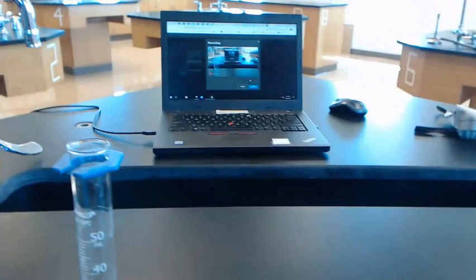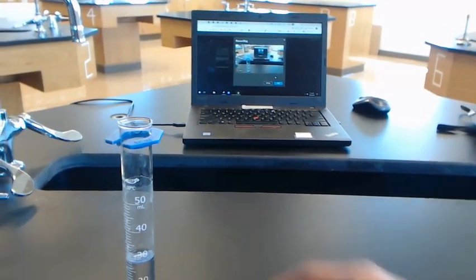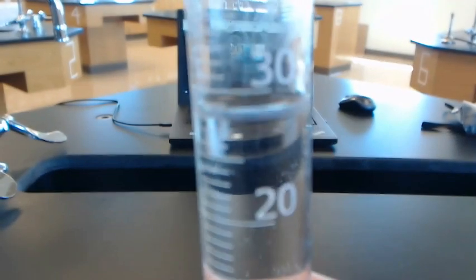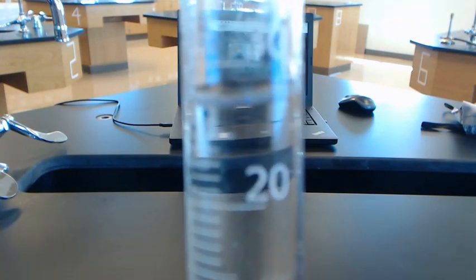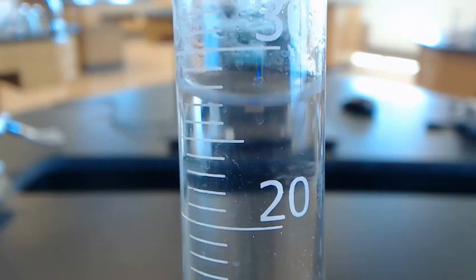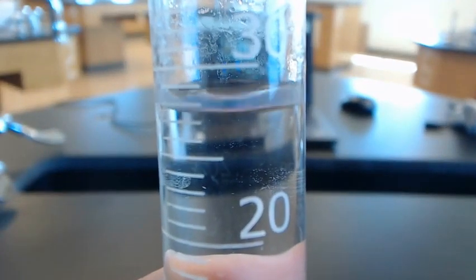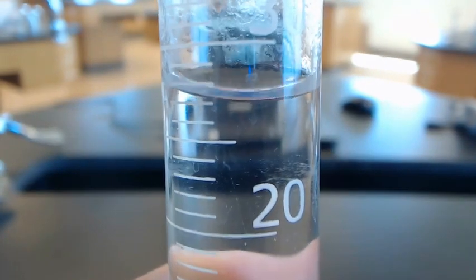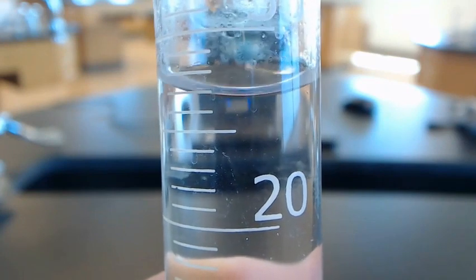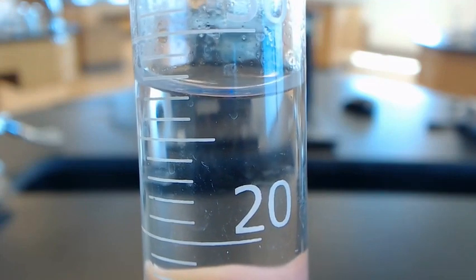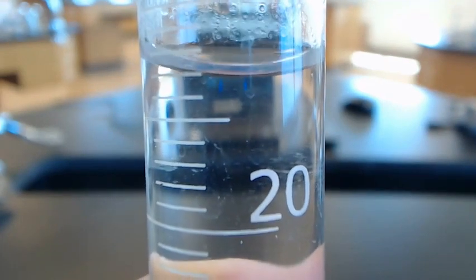All right. So that's length. Let's take a look at graduated cylinders. So I'm going to try to show you this as best as I can. But graduated cylinders, all right, they are used to measure volume. There we go. They're used to measure volume. I'm very shaky, so I'm going to try to keep it as steady as possible. What you are seeing here is that you see that little dip. There we go. That little dip is natural with graduated cylinders. No big deal. You've probably heard of it before. It's called a meniscus.